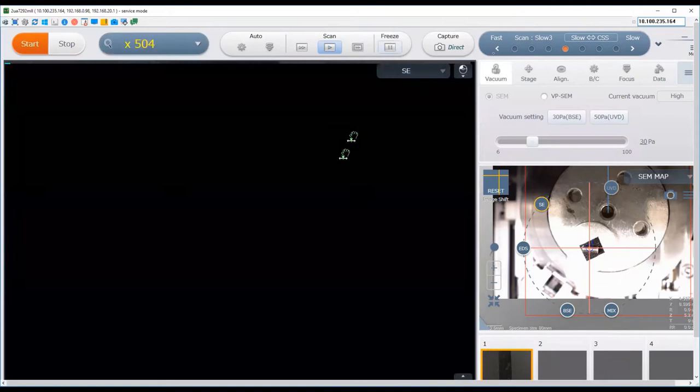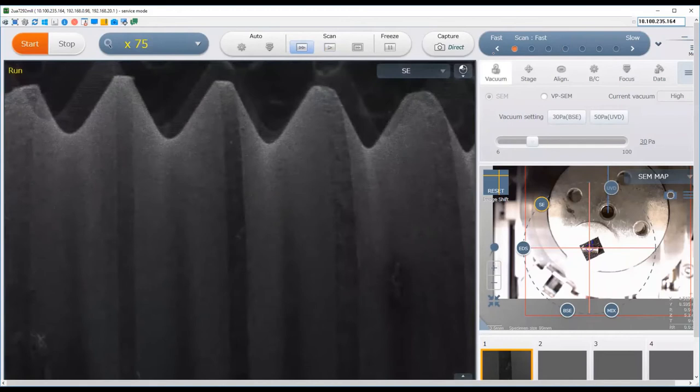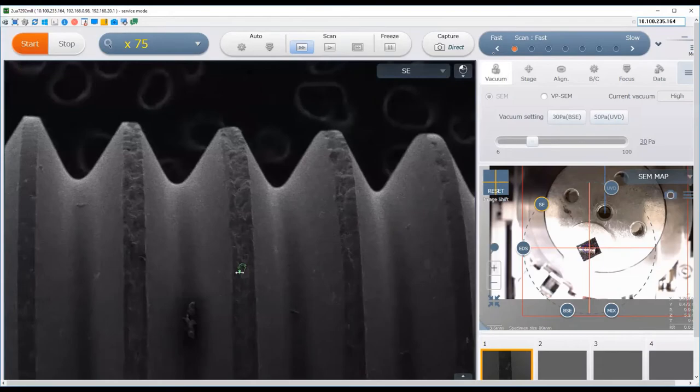Once you've captured your image and want to start scanning again, click the run button and it goes back to the slow scan. Increase the speed to the fast scan and zoom back out to find another area. This image is being captured with the secondary electron detector, as indicated by SE. This gives you the best resolution and tends to highlight edges on features.